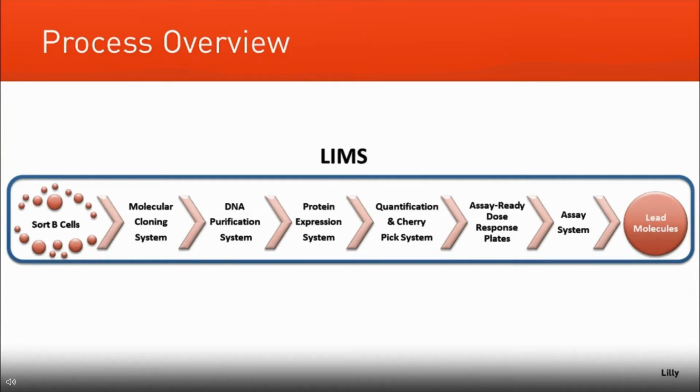So we have several platforms I'm going to discuss throughout this process, and these are really all tied together with a LIMS infrastructure. So we are working on collecting information from each of these platforms in the form of data as well as sample tracking.